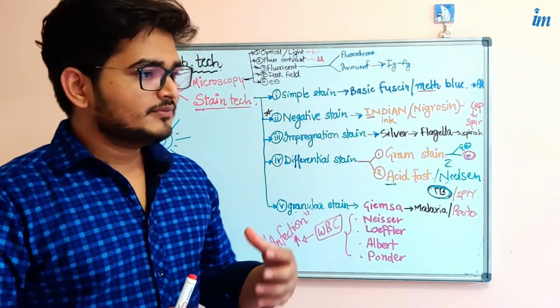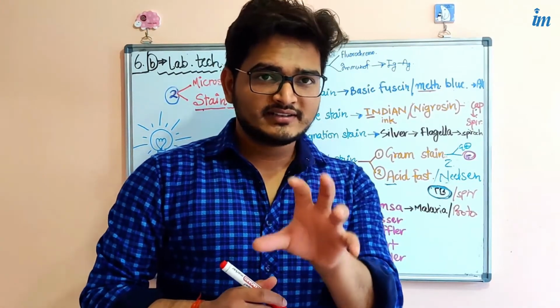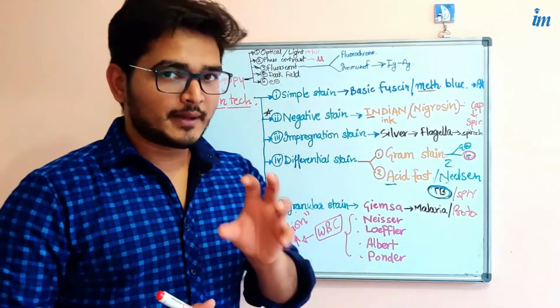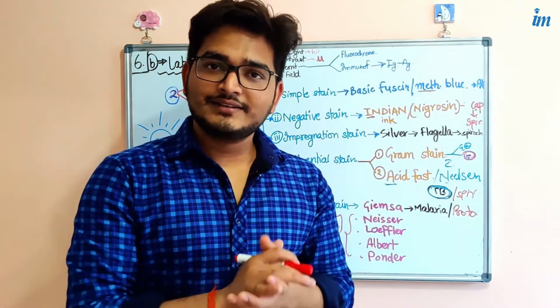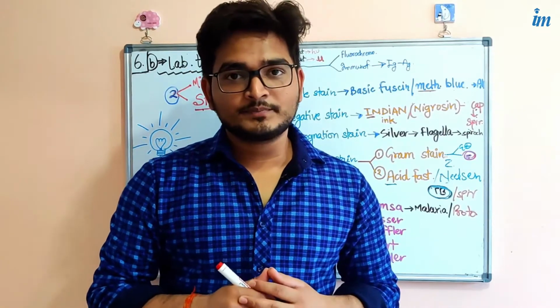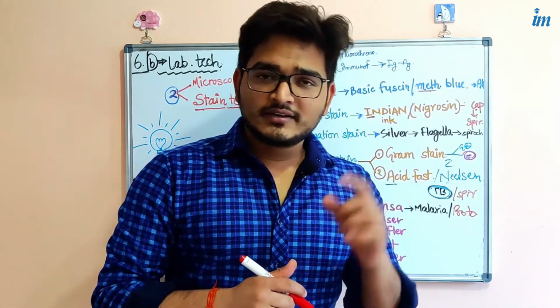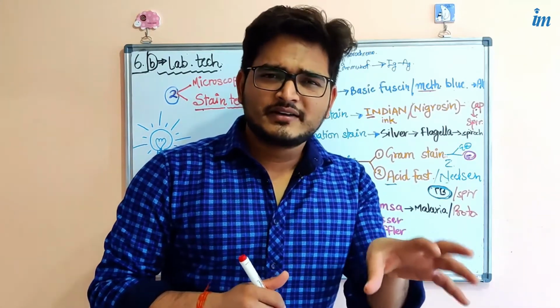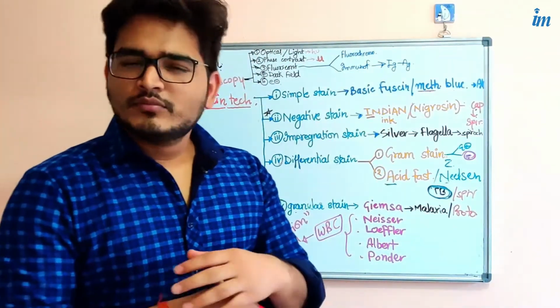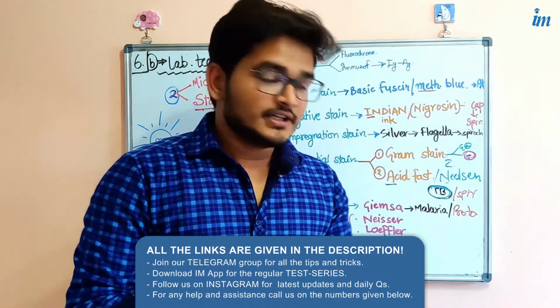See why this one is very effective, that basic dye. A lot of the time when you see a question, if you set aside the question, just tell the concept behind it: methylene blue has a strong capacity to stick to the cell surface or cell wall of microorganisms, especially bacteria. So you can identify that there is a bacterial infection, or in simple words, that bacteria are present. That's why methylene blue is most widely used in dyeing or staining.